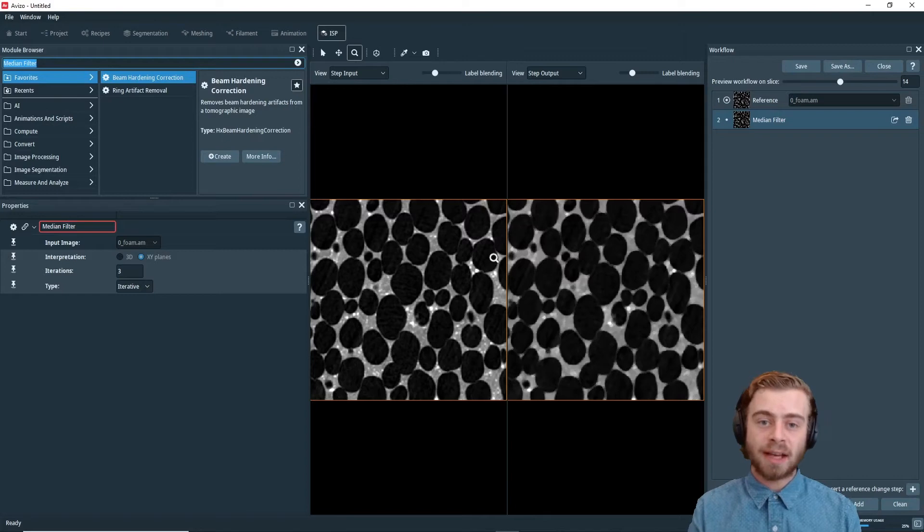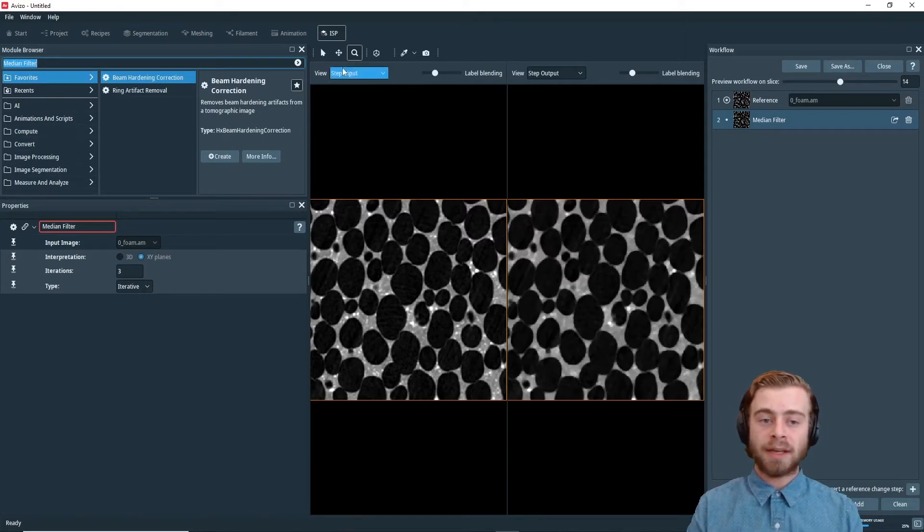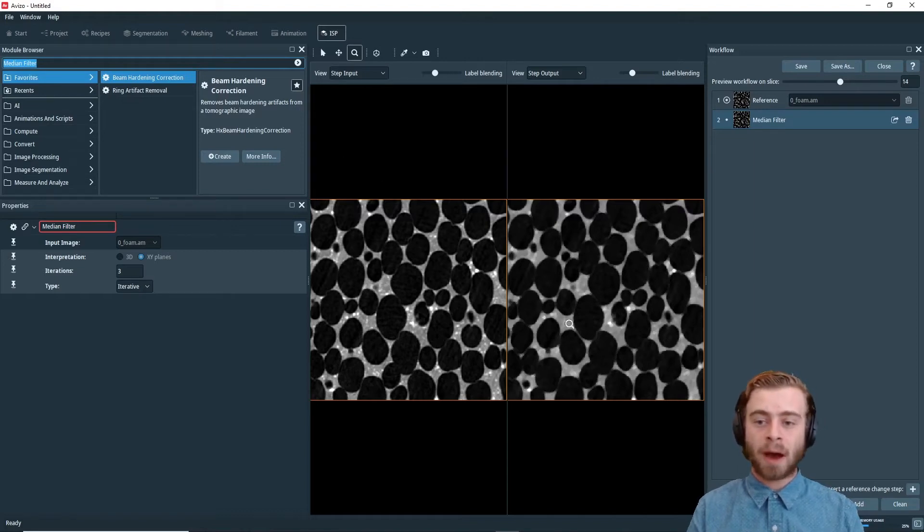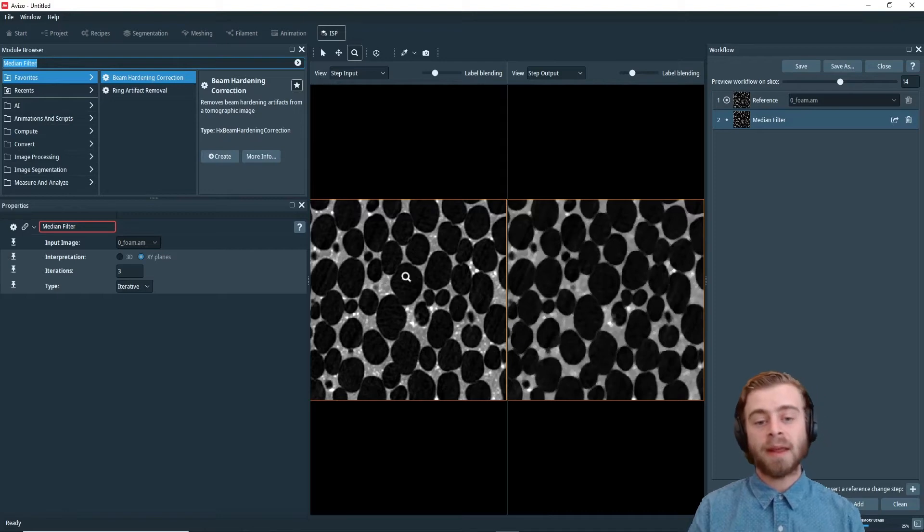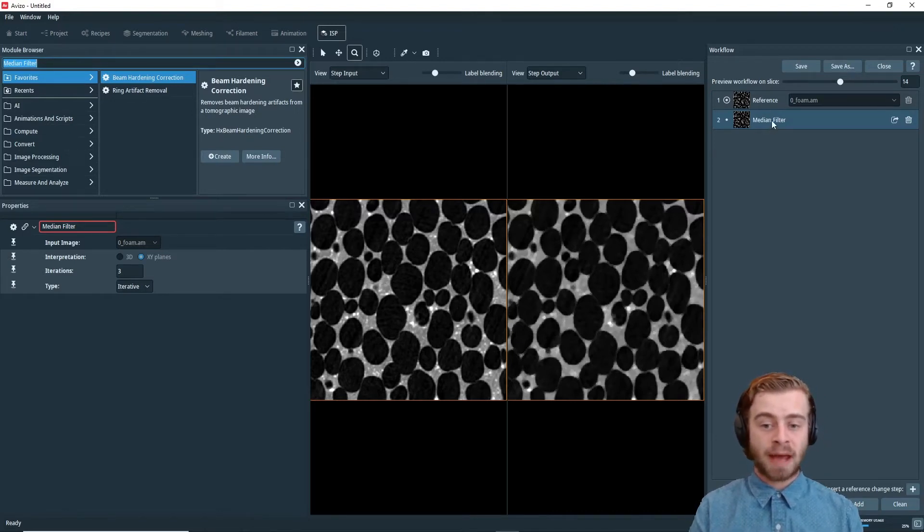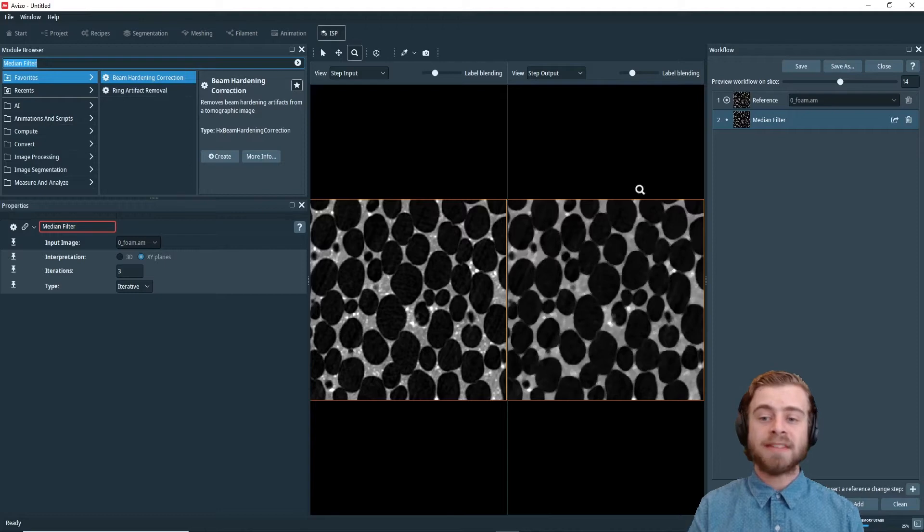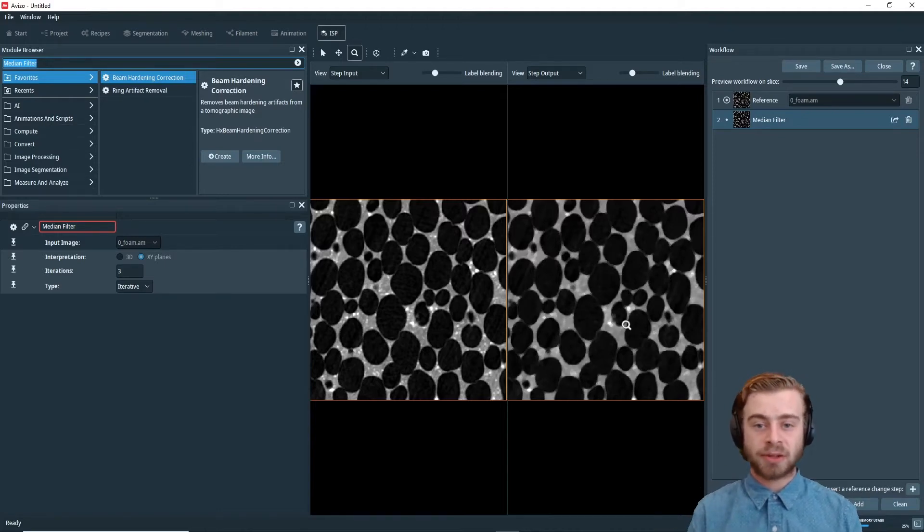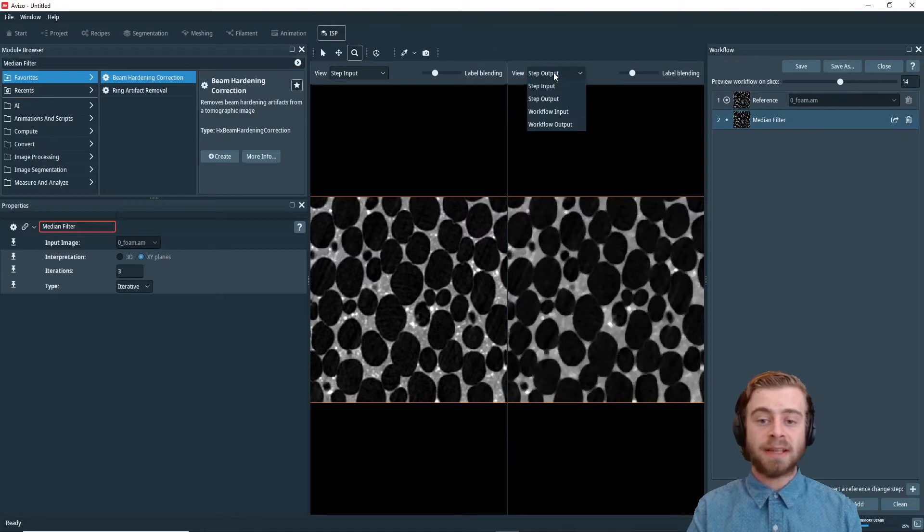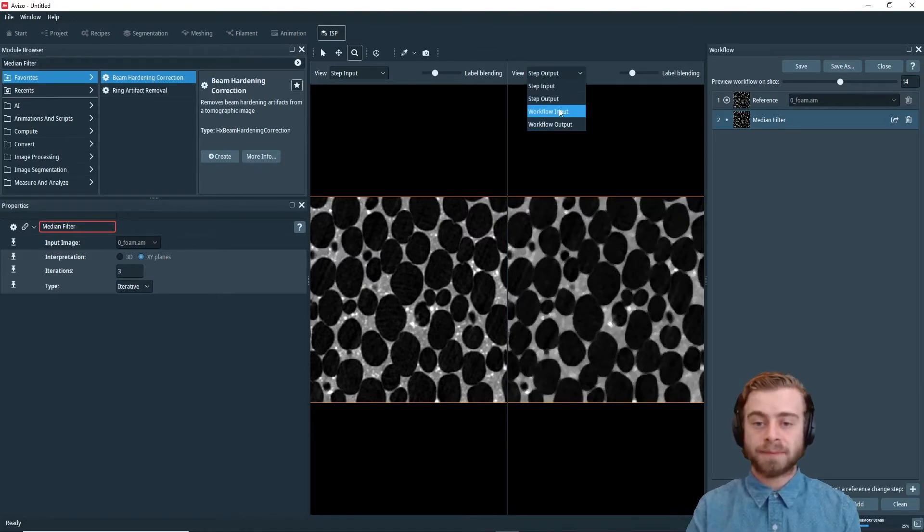The next thing I want you to notice is up in this View tab. You can see up here how this view is the step input, and this view is the step output. So now we have the step input be the original image, because that's the input to this step. And the step output is the original image with a median filter applied to it. You can change this to be the step output, the workflow output, or the inputs too.